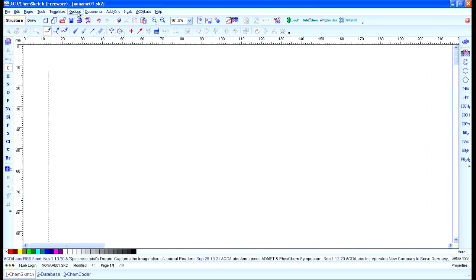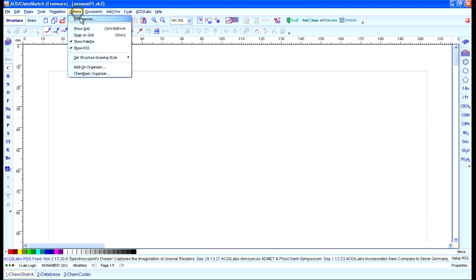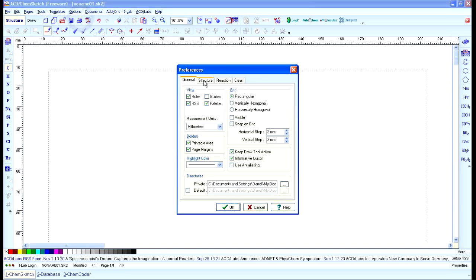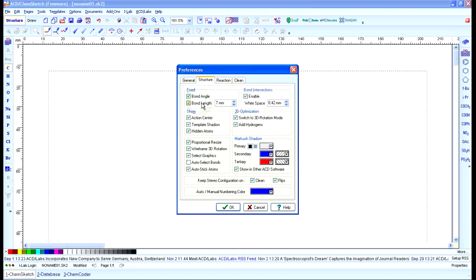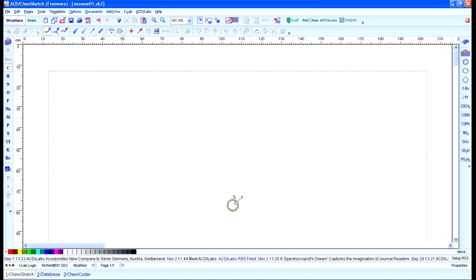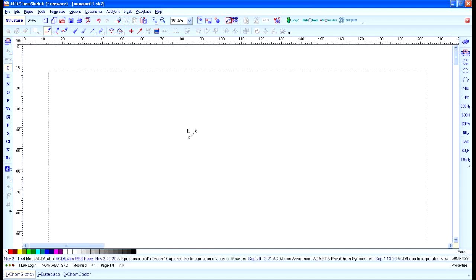The next thing you want to do is click on Options, then Preferences. Under the Structure tab, make sure that Fixed Bond Angle and Bond Length are selected, and click OK. That will help ACD Labs ChemSketch create nicer looking drawings by default, so you'll have to do less editing and cleaning up at the end.